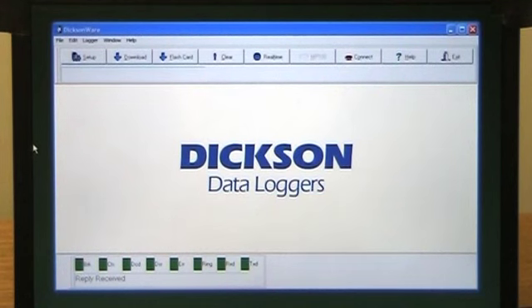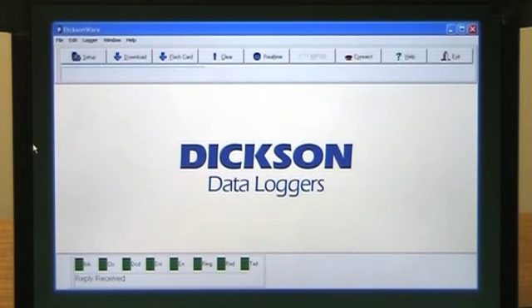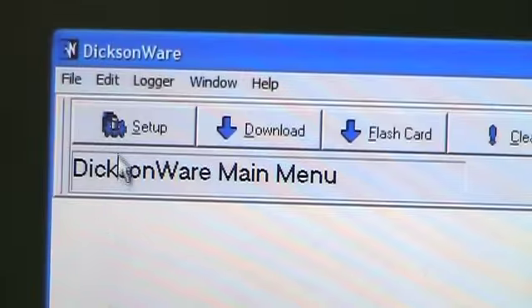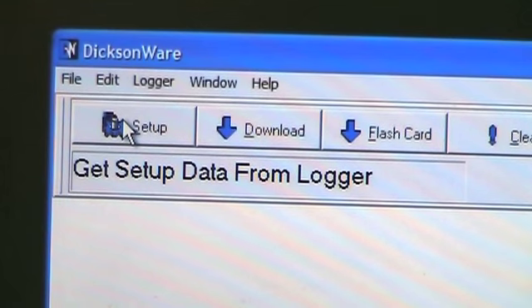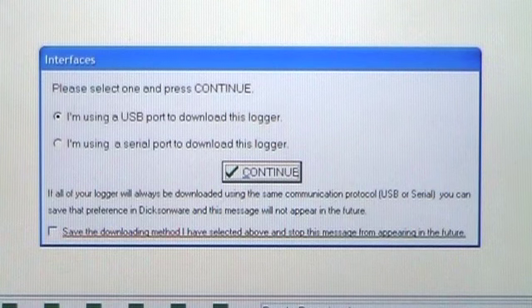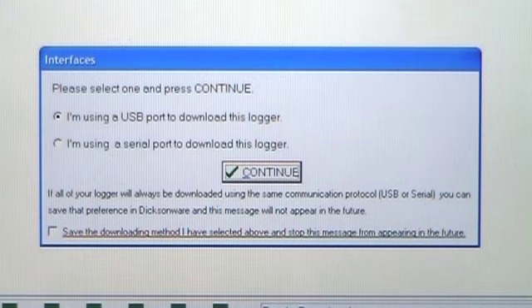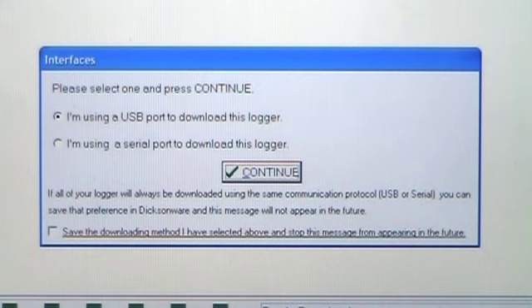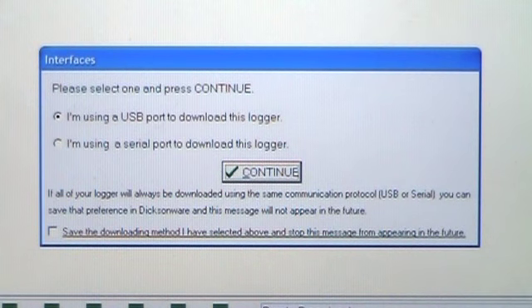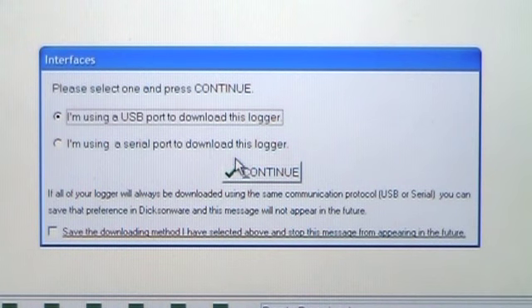To begin setting up your logger, in the upper left-hand corner of the software, choose Setup. Choose either USB or serial as your cable connection, then choose Continue.